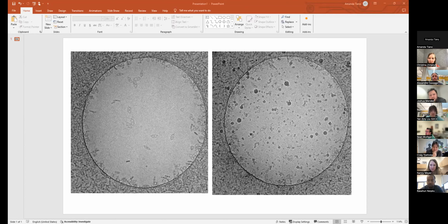I would guess the vacuum's bad. Yeah. So this is not unloaded and reloaded, right? It was there, and then a few hours later, you start seeing this. Yeah, so we have an F20, so it's a single load type system. We did just replace our IGP1, and according to the software, the vacuum is where it should be.